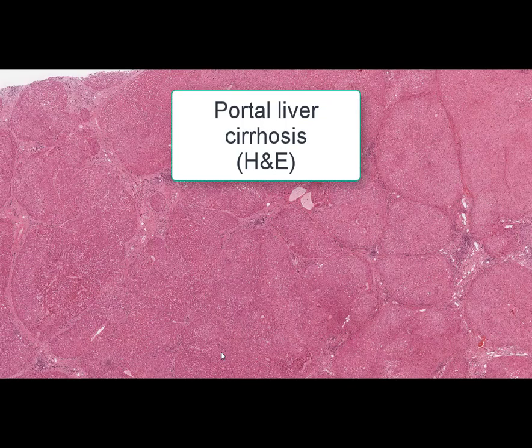On this slide we can see a liver. The stain is hematoxylin and eosin, and the name of the slide is portal liver cirrhosis.